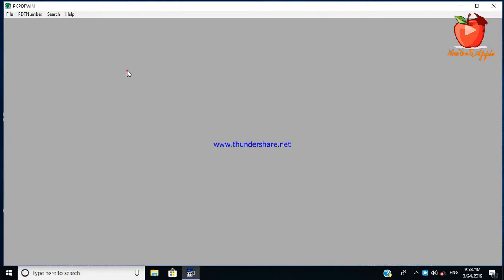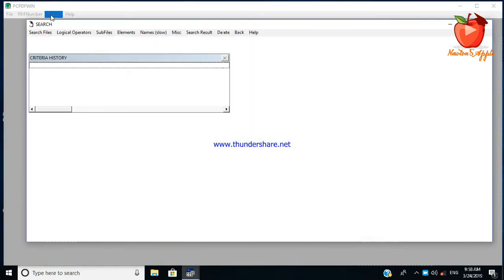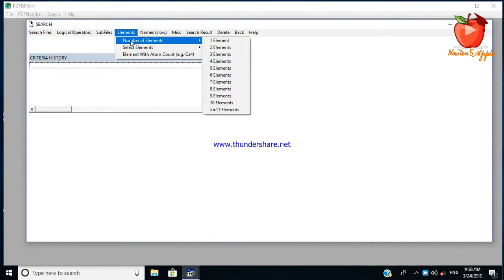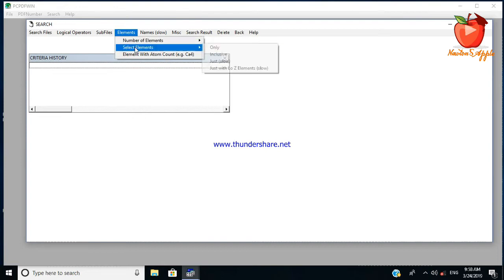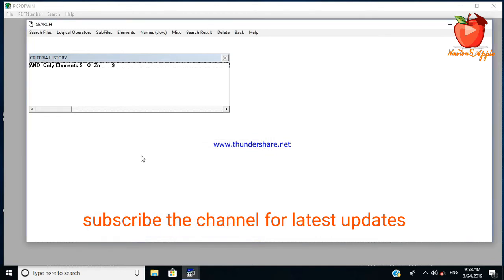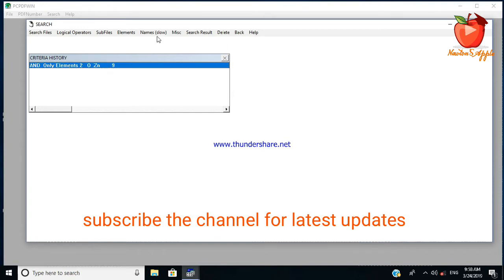Let us search the elements. I want to select element for zinc oxide, so I will select zinc and oxygen and then click to go. I get nine results of the zinc oxide.